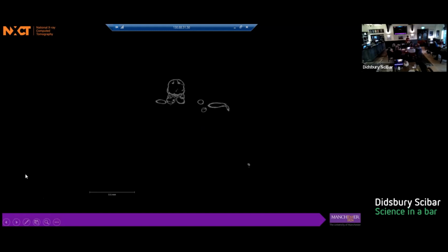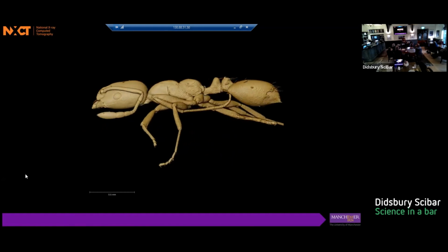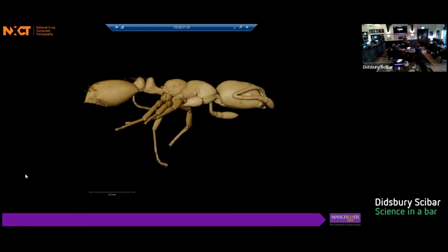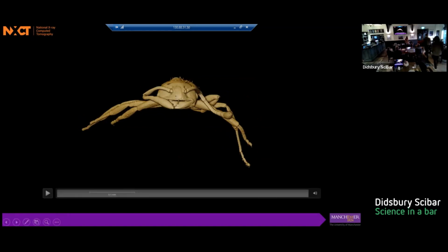And this is another great thing that CT can do, it can give us the ability to do a comparable study. We can take a 3D rendering of a garden ant to scale in the computer, a 3D rendering of this species of ants, the Pharaoh's ants, and compare and contrast them in the same way that you would with physical specimens, except on this scale, it's very difficult to do that. If you have something like a bird or a medium-sized mammal, you can get the tape measure out and do some quite nice measurements and compare that way. But when you're dealing with something so small, it becomes very difficult to do it under a microscope. And so something like CT really helps.